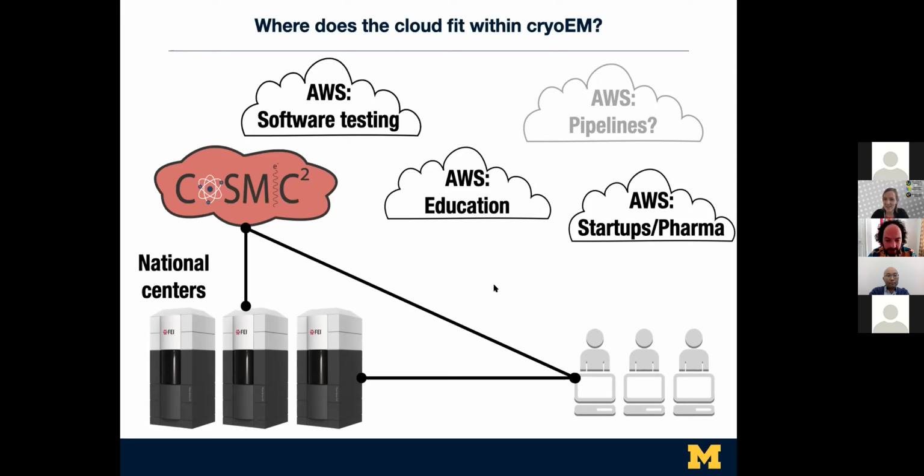And you're right to point out that there is a very intense input-output limit. For Warp and RELION, it should be okay because you're just taking the Warp data and doing a RELION polishing step. For M, I don't know yet. I haven't run M myself yet. So it does require paying attention to it, though. So it should be possible.